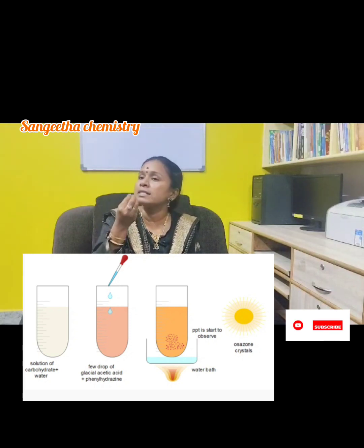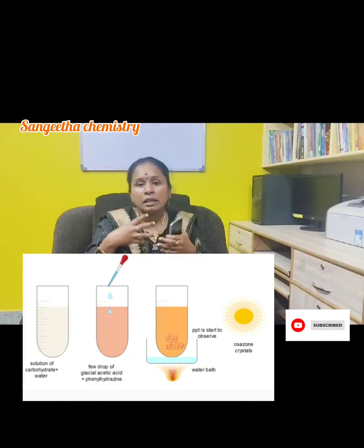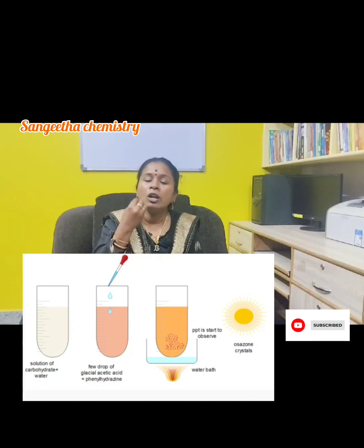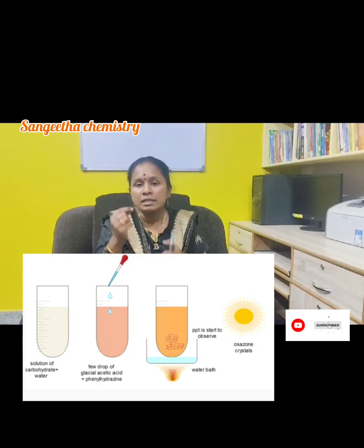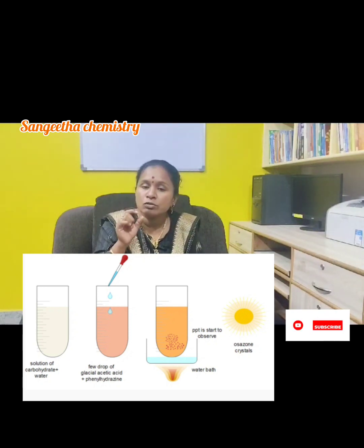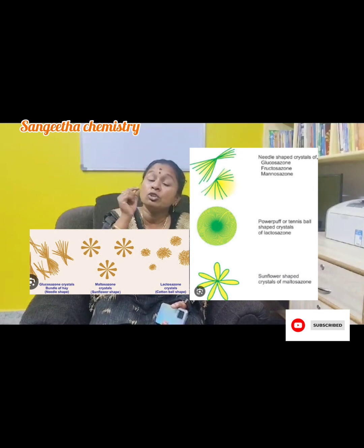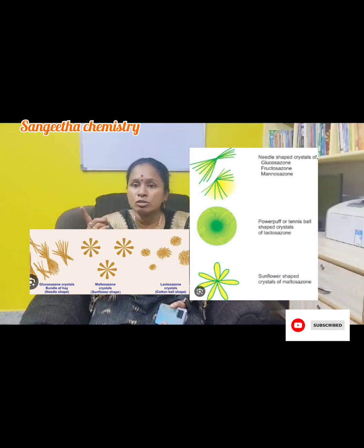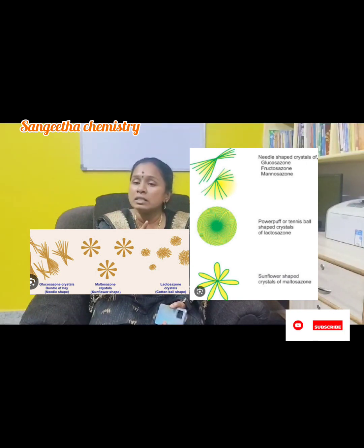The reaction will take some time in the test tube. Once complete, there will be a color change. Take a small amount with a spatula onto a glass slide and observe under the microscope at 10x magnification. A needle shape indicates glucose or fructose. If the Seliwanoff test is positive, it is fructose; if negative, it is glucose.